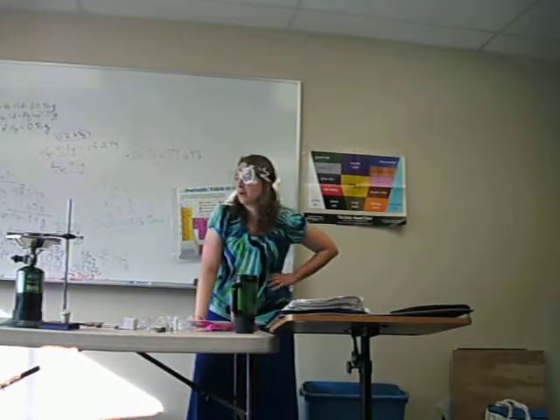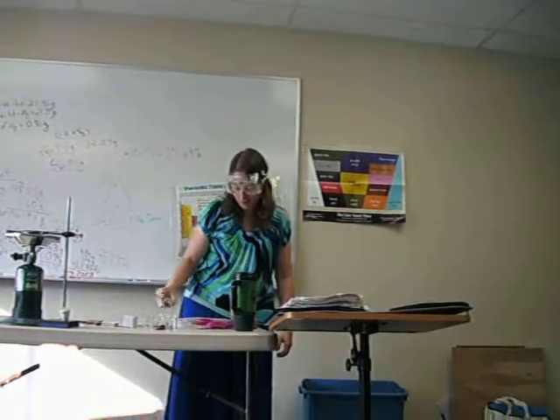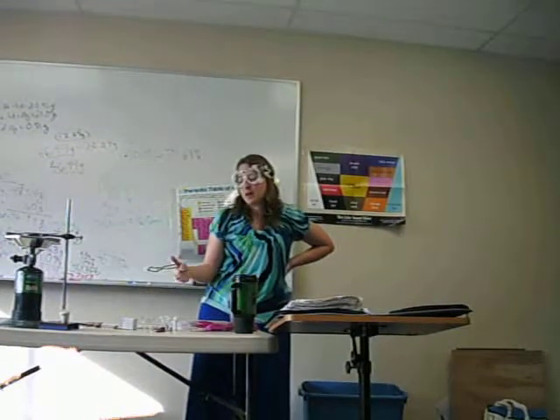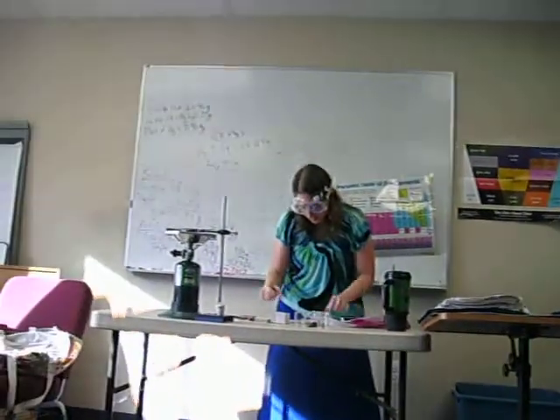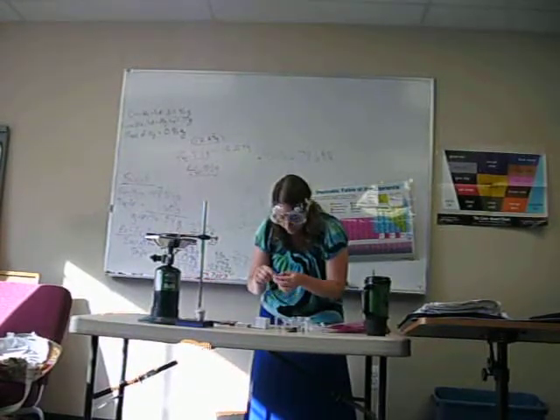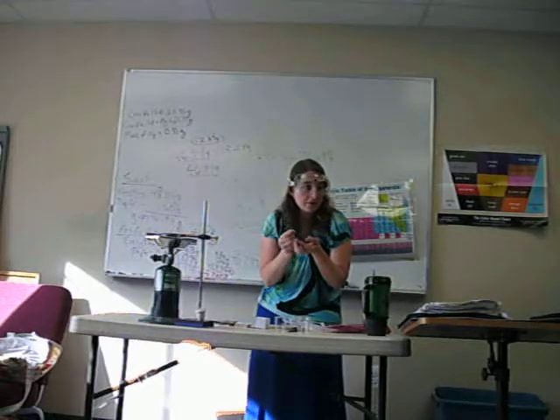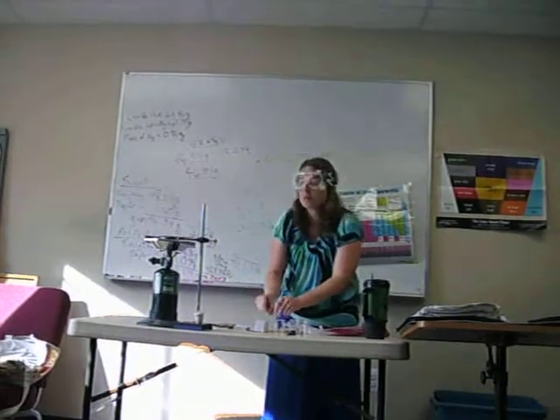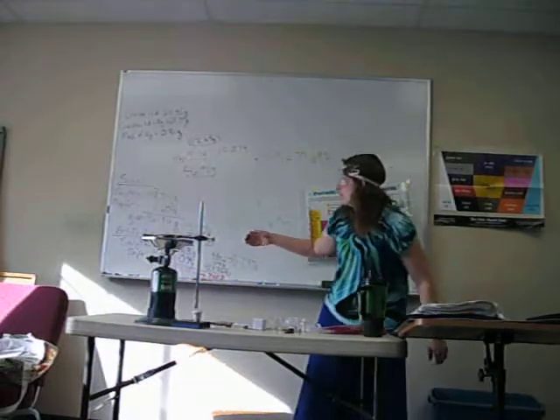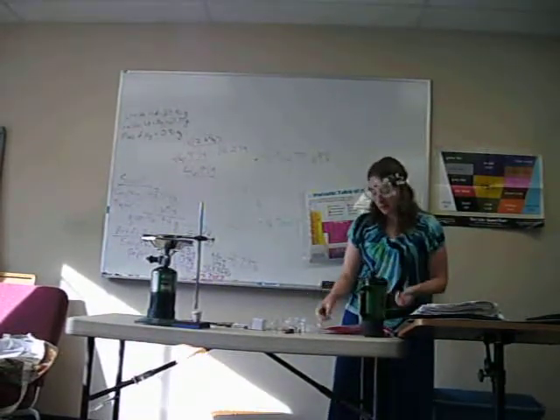Did you all see the kind of vapors wafting when I removed the lid sometimes? I think we're losing a little bit of mass just from that updraft from the heat. That's a source of error. The biggest source of error in this experiment, though, is sometimes, like when I burned this piece of magnesium here, if I sift through, right here, see there's little flecks of magnesium that just got coated in magnesium oxide but didn't actually react, because no oxygen could actually get to them. So that's the big source of error: some magnesium metal didn't get to oxygen to react. It just remained magnesium metal, and it didn't form magnesium oxide.